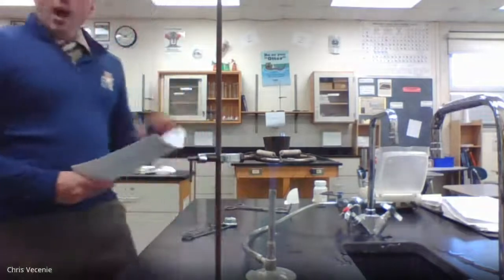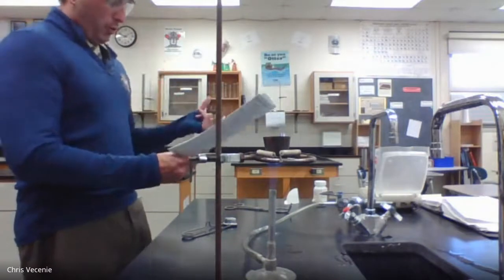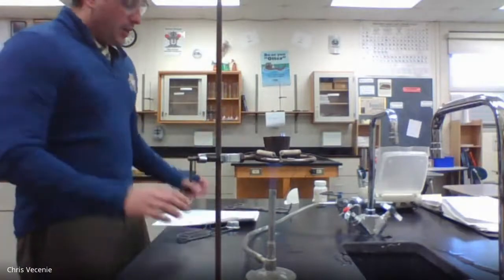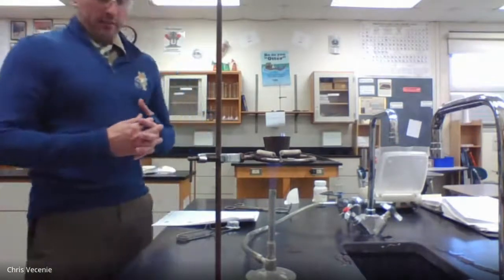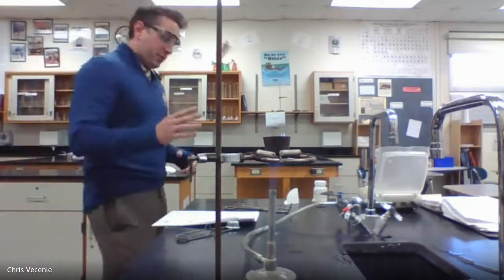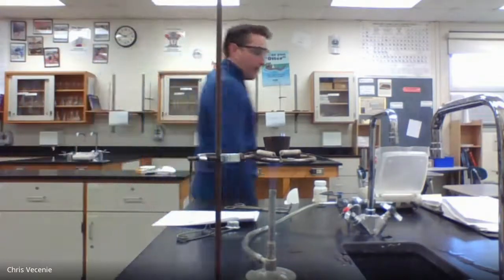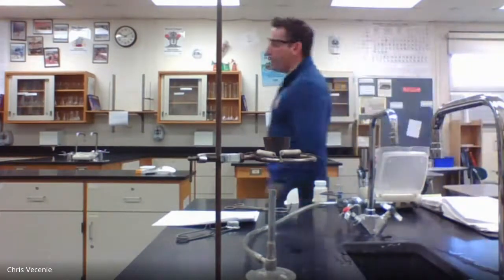While that's heating, always keeping an eye on it, but looking where we're going next. Then I'm going to come right back and weigh the crucible on the balance to see if there was any change in the weight. I'm going to keep going through that process till I get a consistent weight, because if there is water on there and it is leaving, we want to make sure it's all gone. So I'm going to heat for 2 minutes, then get the mass, then heat for 2 more and get the mass, unless we happen to be fortunate enough that our crucible, after we heat it for a minute, happens to be the same. So we still have about a minute to go there.